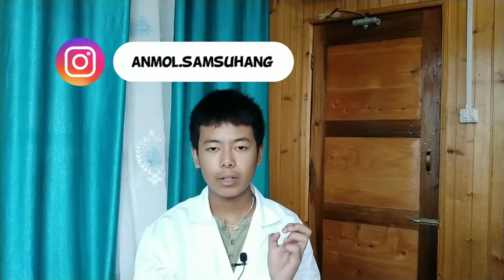Microscopy. So in this video we are going to discuss various types of things which are necessary or needed for microscopy. Without them, microscopy is not possible. So you need a compound microscope just like this, which I use.